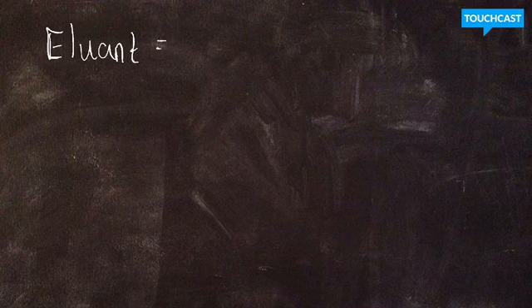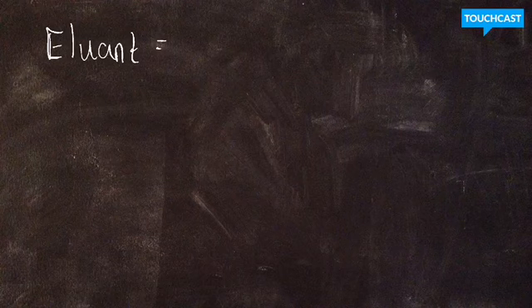So this word, eluent, I'm not even sure I'm pronouncing it right. An eluent is the volume of the material that pulled through. You know how we're going to pull out different colors of each dye? This is where you go, aha, I see this particular substance in here.